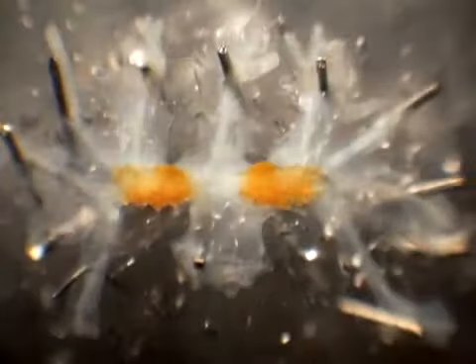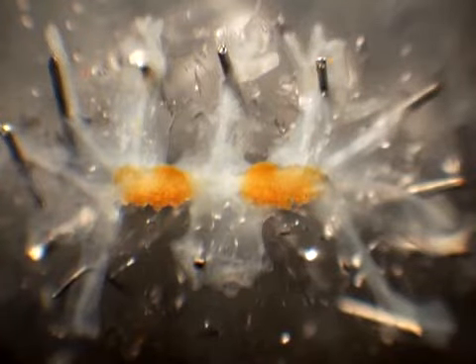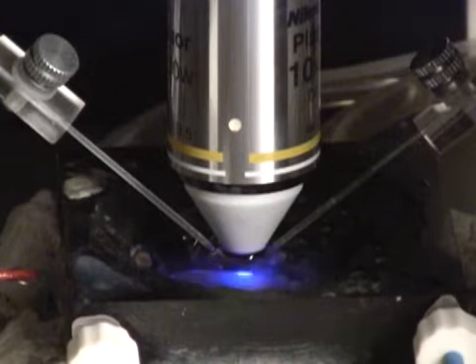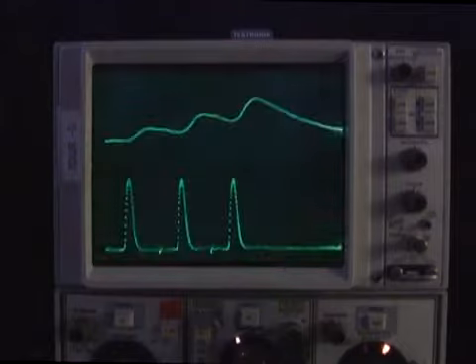Our experiments are conducted with a ganglion of the mollusk Aplysia californica. This preparation has a number of advantages, such as large identified neurons. The low temperatures that are natural for Aplysia slow signals and facilitate imaging. But the general techniques we demonstrate are easily transferred to other systems.